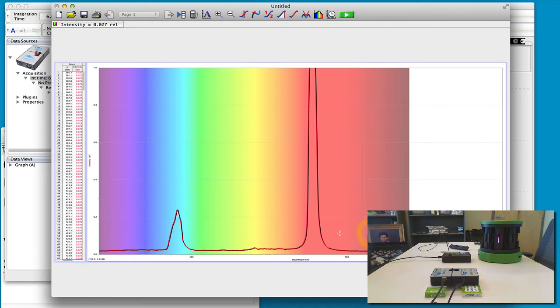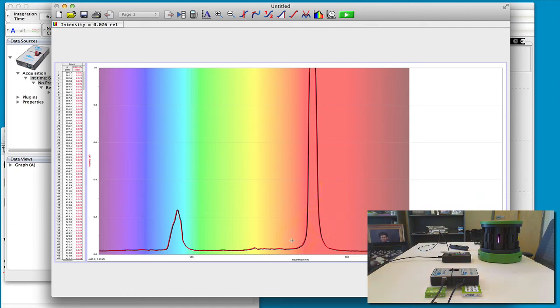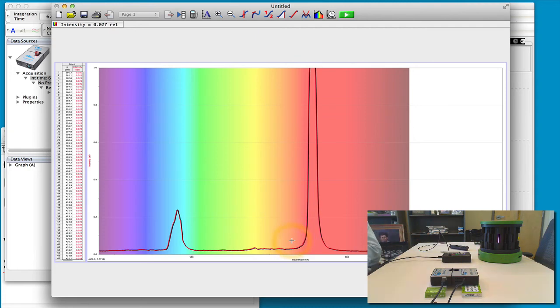And you can tell it's not nearly as high of resolution as the other one which has a CCD with a larger array CCD camera with better resolution. But you can collect it on either of these, in this case you can get two of the Balmer series lines.